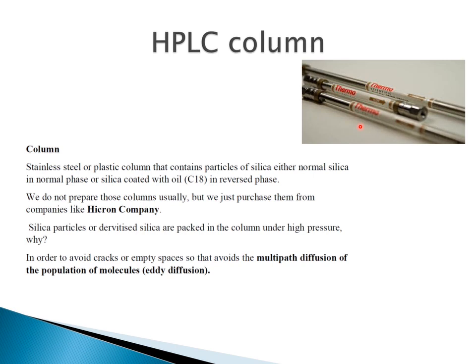Honestly, it is a highly technical procedure, as the particle bed should be filled in a way that avoids any possible cracks, large void volume, or even a badly distributed bed. So this cannot be achieved by simple filling. It should be done using highly sophisticated instrumentation and pumps, and this cannot be simply done manually.